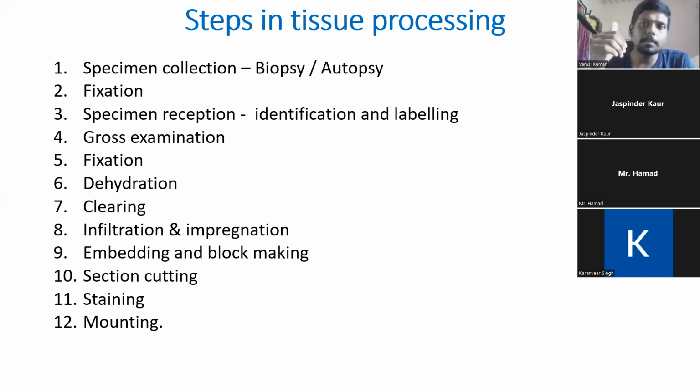After these things, the next important thing is that with the help of a sharp blade, we need to cut the sample. Upon cutting, we need to give the description of the cut surface. What is the status of the cut surface? So I cut the organ. Upon cutting, if I encounter any calcium nodules, then I need to write that calcium deposits have been identified upon cutting the sample.